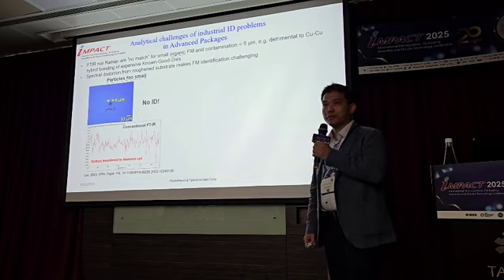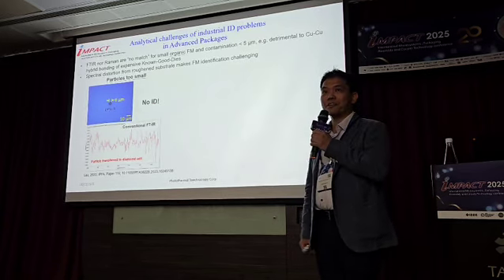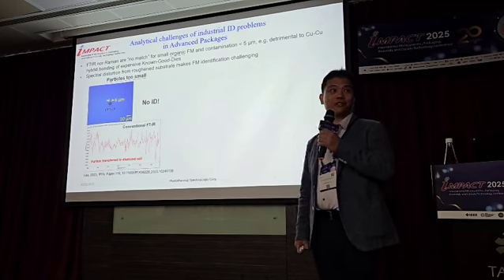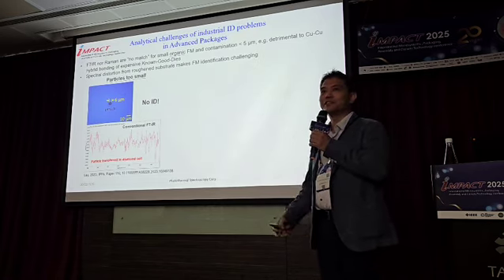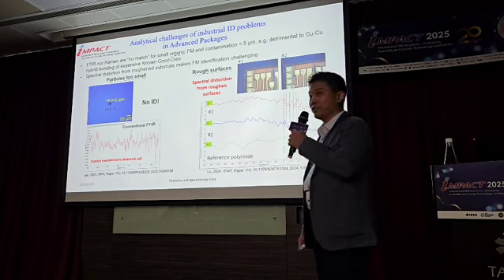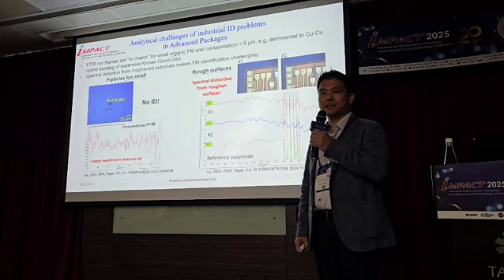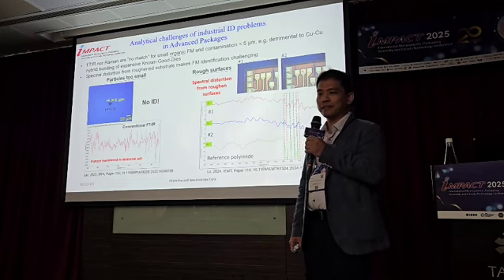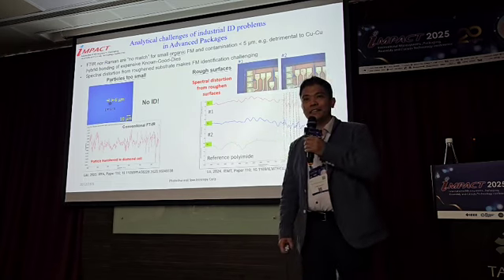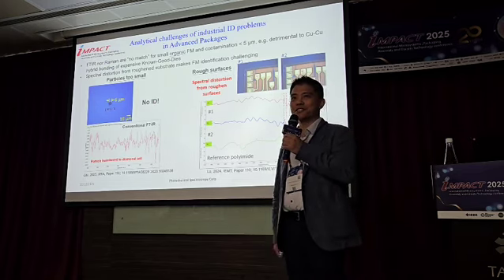All right, so I'm sure every day you run into something like this. You have a particle that's small, less than 10 microns. If you're trying to analyze a particle like that with FTIR, chances are you probably won't get any result out of it. And to a certain extent, it's also true when you have some contamination on a metal substrate along the rim: it might be challenging to find out what it is using reflection FTIR. In the past few decades, this is a fairly repeating theme of its own.